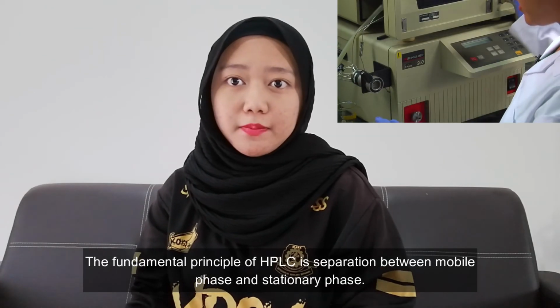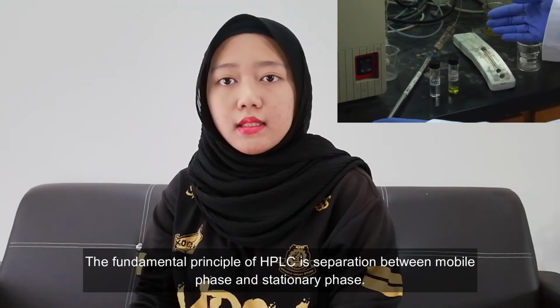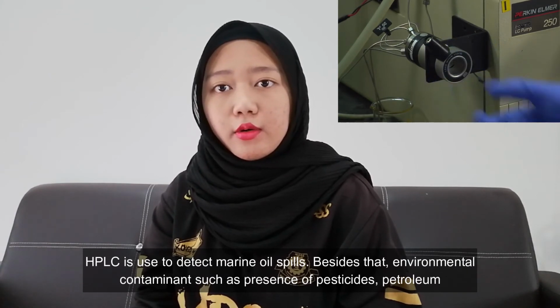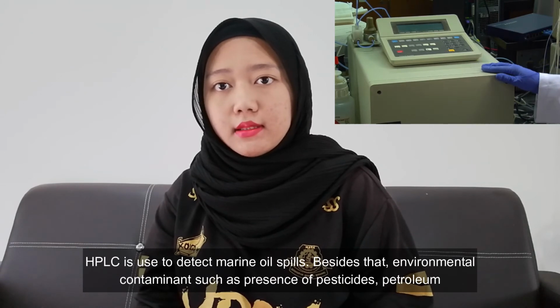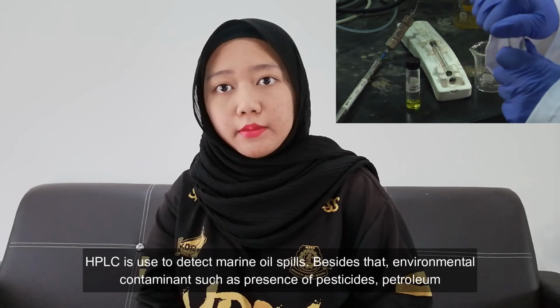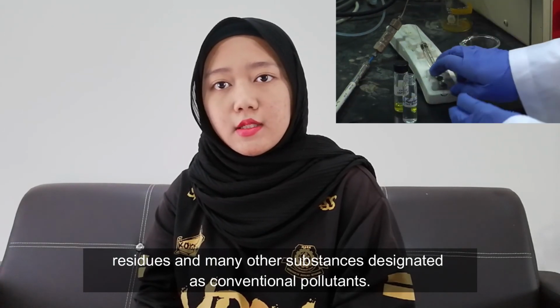The fundamental principle of HPLC is separation between the mobile phase and the stationary phase. HPLC is used to detect marine oil spills. Besides that, it detects environmental contaminants such as pesticides, petroleum residues, and many other substances designated as conventional pollutants.